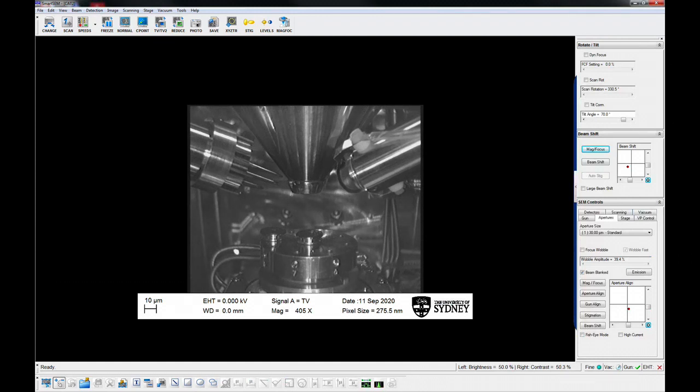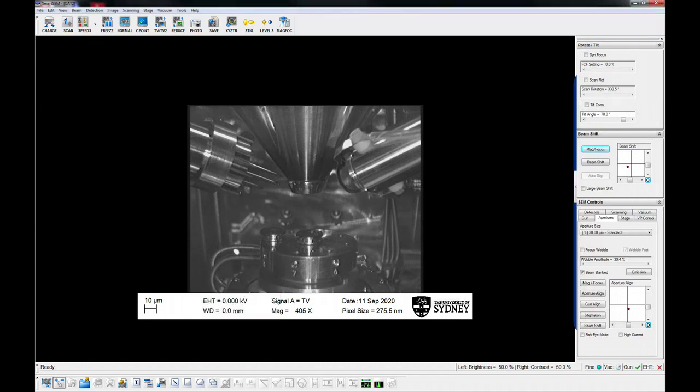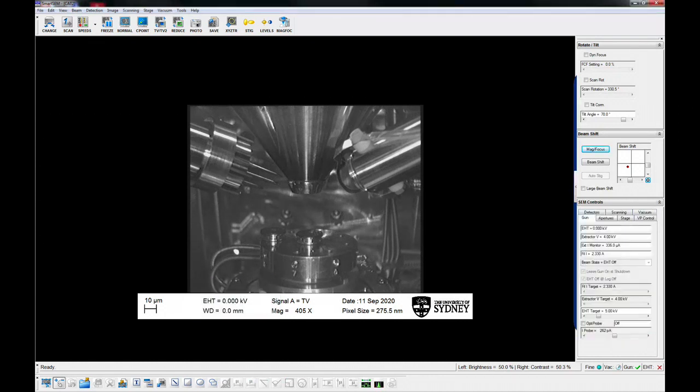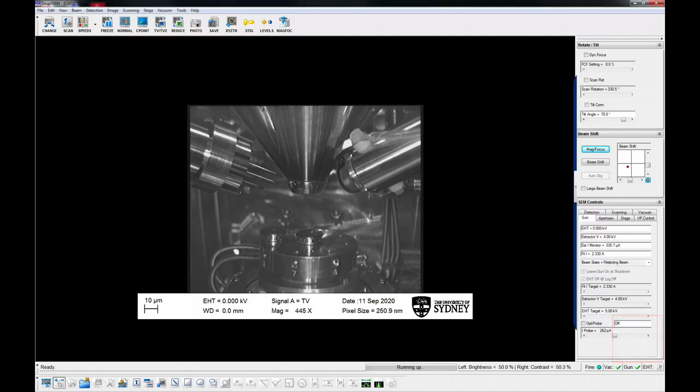Determine the beam conditions for your session. Experimentation will be required to get the optimal settings. Set the desired KV in the gun panel or the data bar on the SEM screen. When the chamber reaches working vacuum, switch on the EHT.